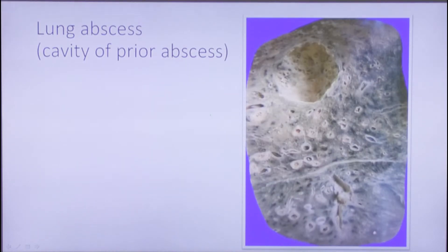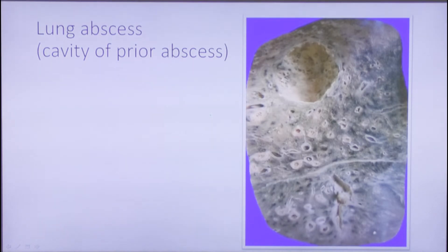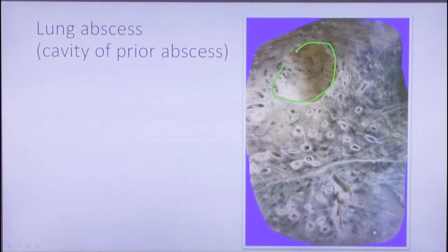Here is a lung abscess — specifically the cavity of a prior abscess. An abscess is a type of purulent inflammation and always has a capsule filled with pus. Obviously we do not see the pus here, but the cavity is present.